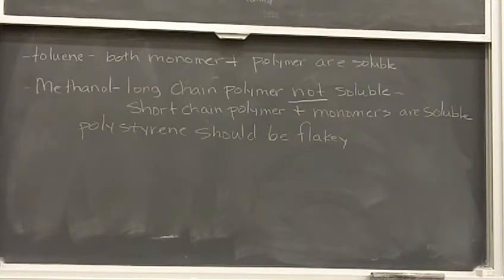So you're going to get out of the reaction as much styrene as you can, and it's going to vary from person to person, but we want to make sure you have enough styrene to go on into the third reaction, okay? So you're going to get styrene from your instructor before you go on to this third reaction. We're going to help everybody out with about 1 milliliter of styrene to make sure everybody is successful in this third reaction, okay? And it also helps with the polymer formation and the solid that's formed to make it form a better solid for filtration, all right?